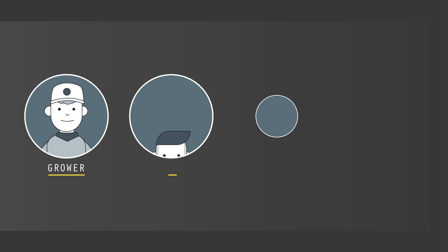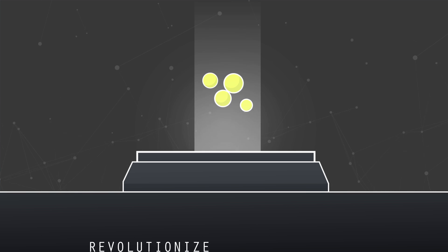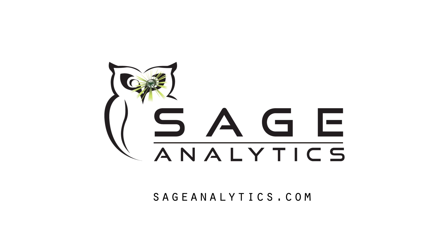Whether you're a grower, extract processor, edible producer, or dispensary, the Luminary Profiler will revolutionize the way you think about potency testing. Get your Luminary Profiler today by visiting sageanalytics.com.